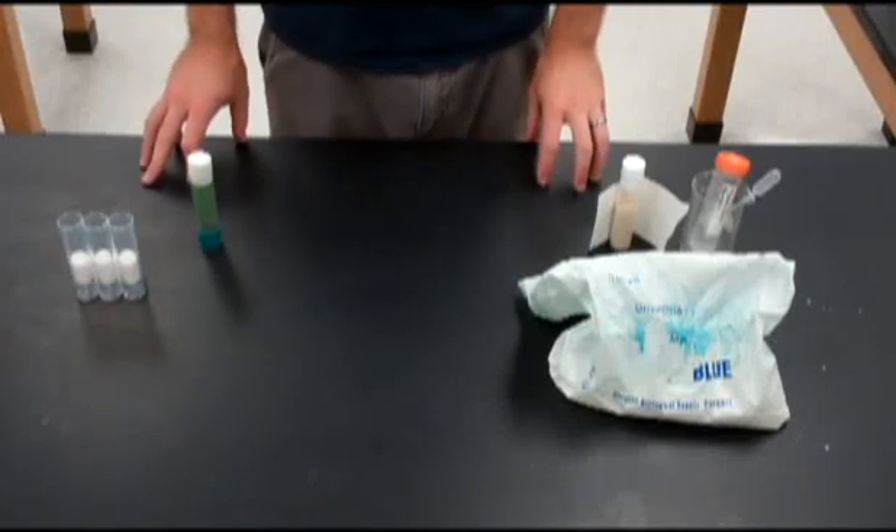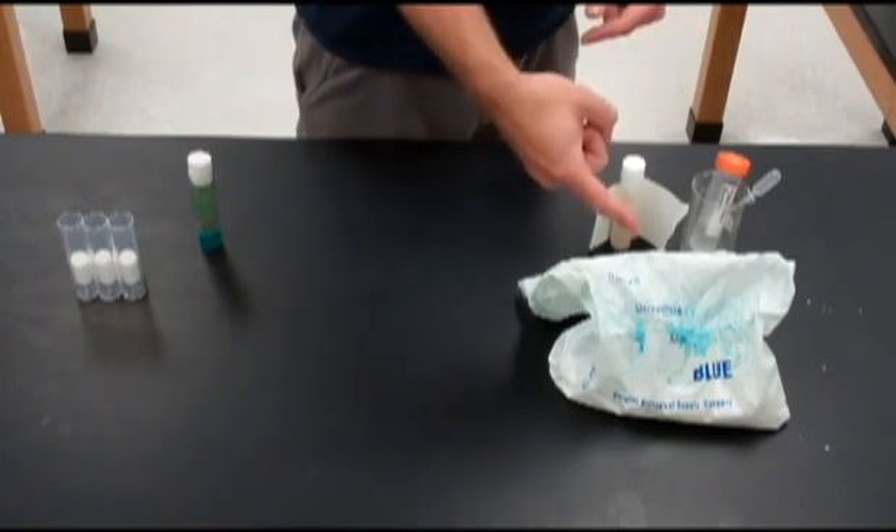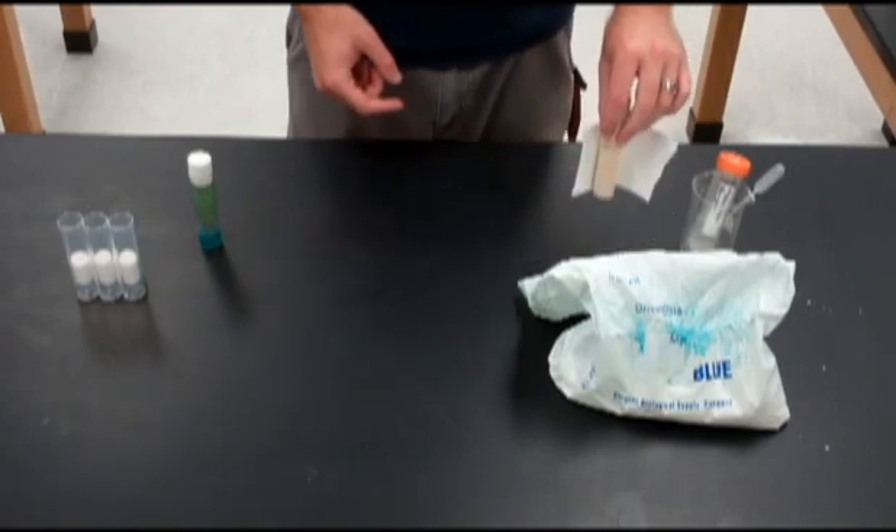Hi, I'm Michael Ralph and today we're going to be culturing fruit flies. You're going to need everything you see right here, including fruit fly food, a can of kanamycin solution, and some yeast.